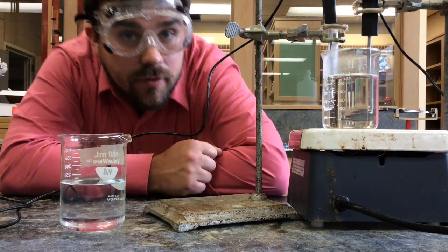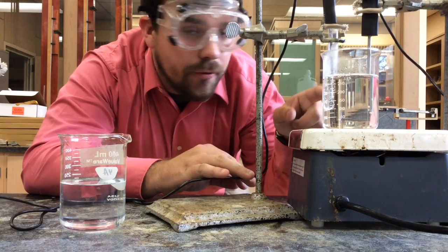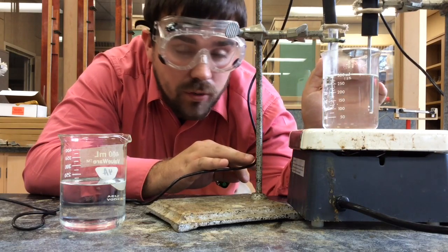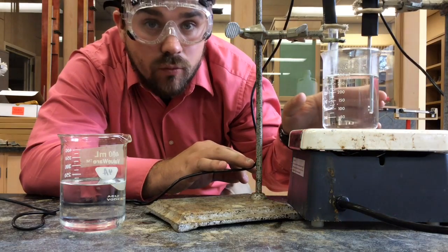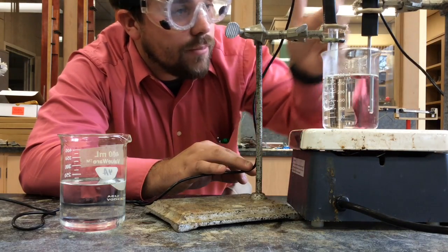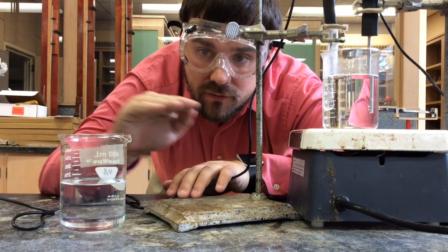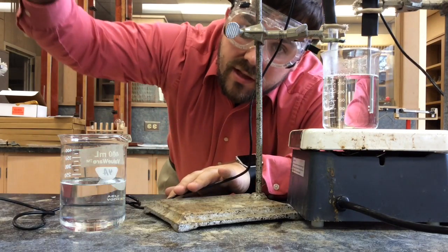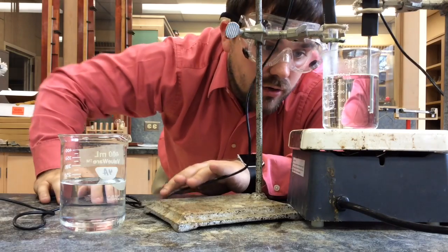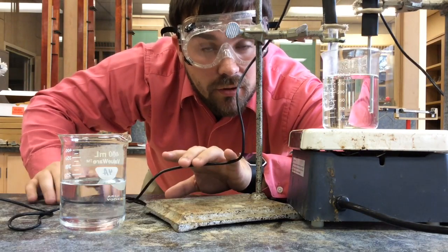All right, so we have observed heating curves of substances, like we observed water and its heating curve. What we did was we put a beaker of ice water on a hot plate and turned it on, and we had a temperature probe in it and monitored that heating curve. What happened was it was flat for a while, and then it went steeper, and then it was flat at around 100 degrees. So we wanted to see if the cooling curve would follow a similar trend.